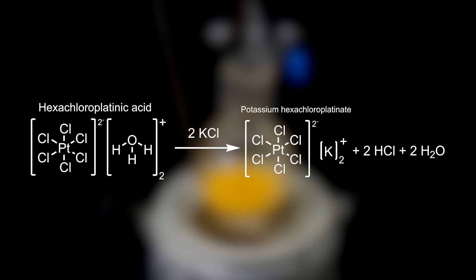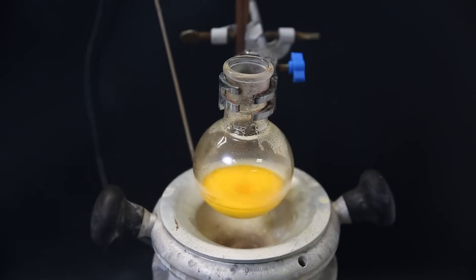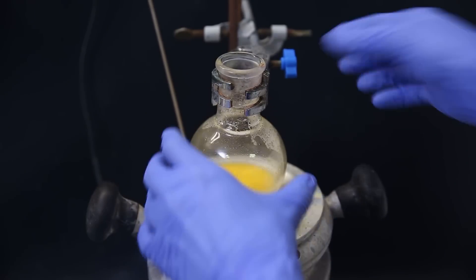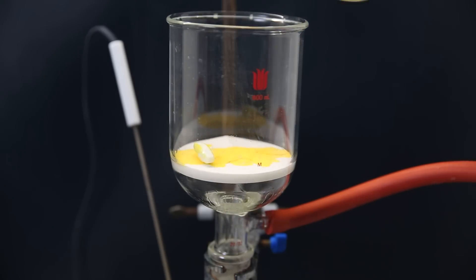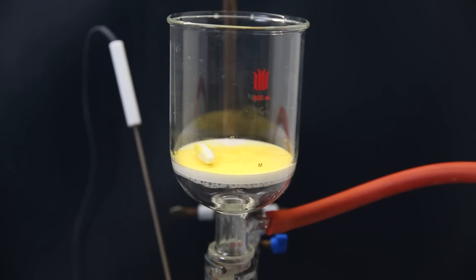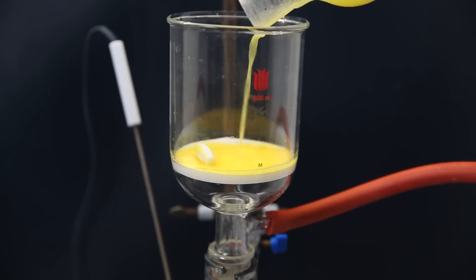The hydronium ions react with the remaining chlorine ions to form hydrochloric acid and water. I let it stir for a few minutes, and then filter it all to collect the yellow precipitate. I wash it once with some 50% ethanol and then once with some 100% ethanol to remove salts and acid.